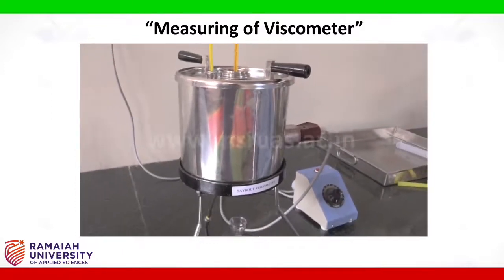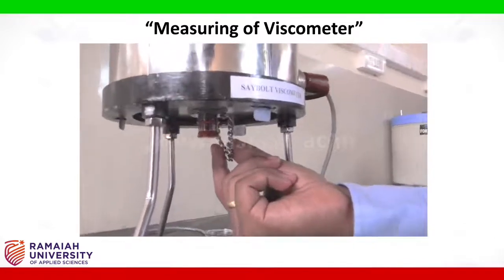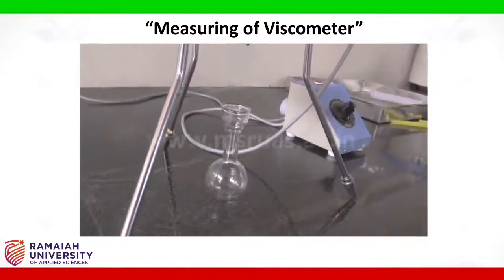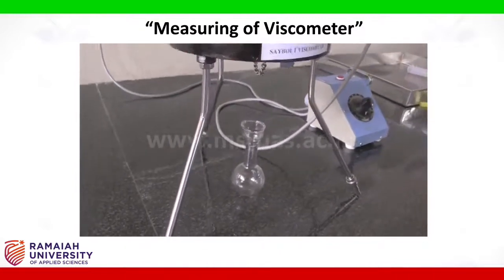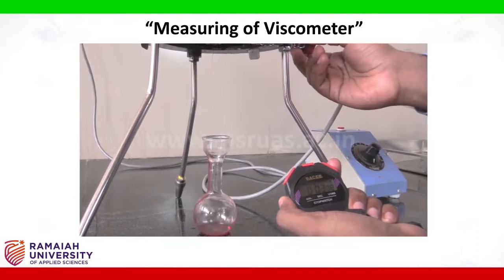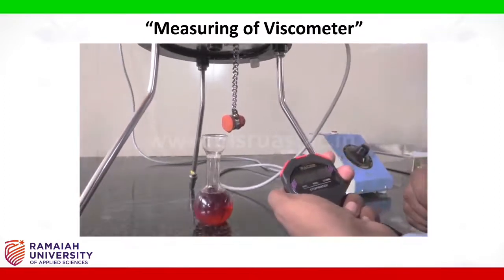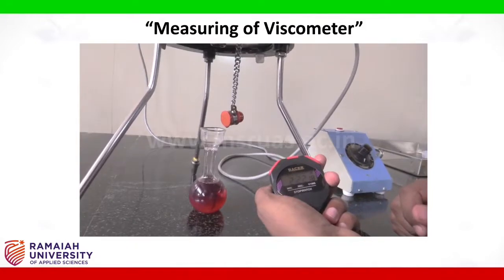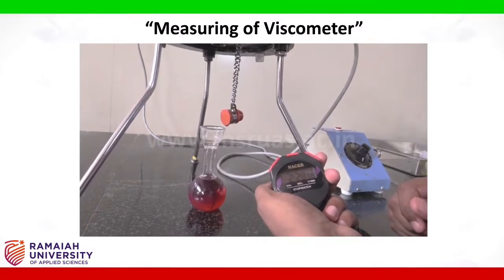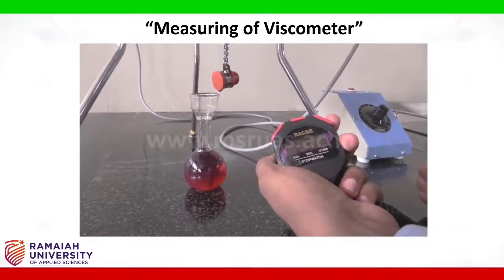In order to do that, we need to first open the cork at the bottom of the viscometer, which will allow the oil to flow through the orifice into the collecting flask. Simultaneously, the stopwatch has to be started. Now, as the oil is being collected in the flask, it is approaching the 60 ml mark. As it reaches the marking, we need to stop the oil flow by closing the rubber cork and simultaneously stopping the stopwatch.